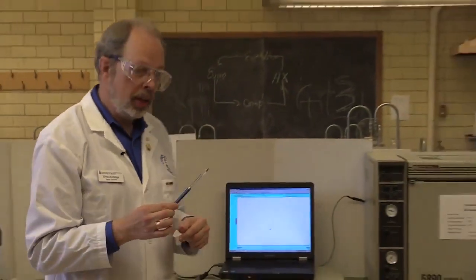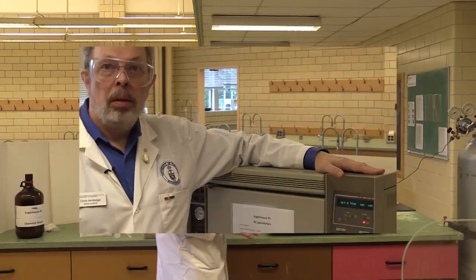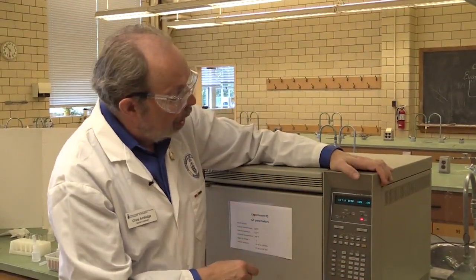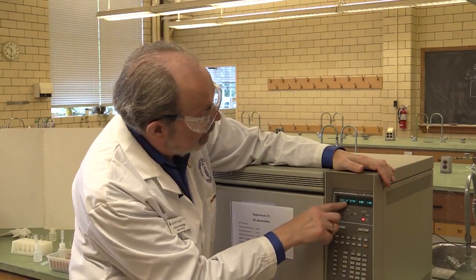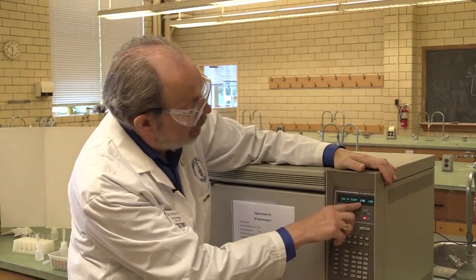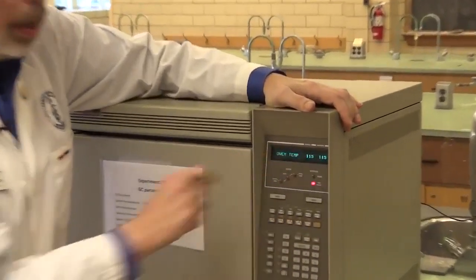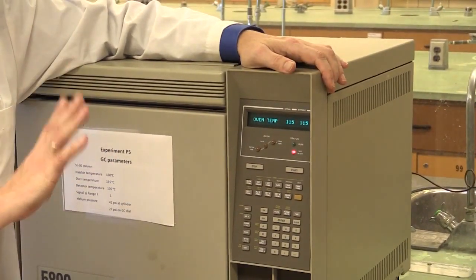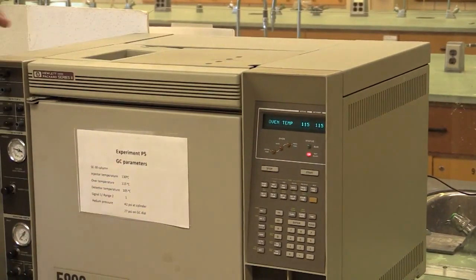Let's go over and make sure that the instrument is ready to go. All right. We'll make sure that the instrument is at the appropriate temperatures. Right here the detector is at 105. We push the injector button. It's likewise at 130. Let's check the oven. And it's at 115, the appropriate set point. So the machine has now equilibrated at the appropriate temperatures. And you can check these on here for what they should be.